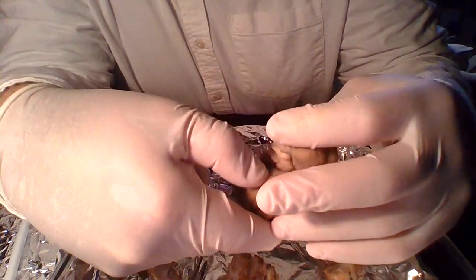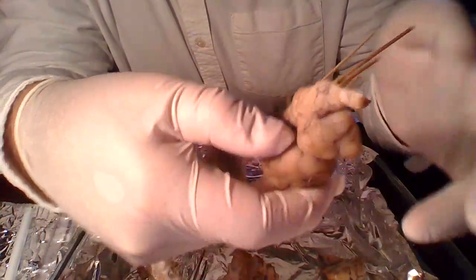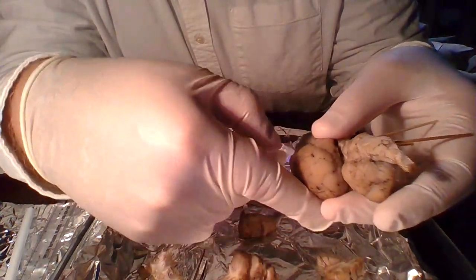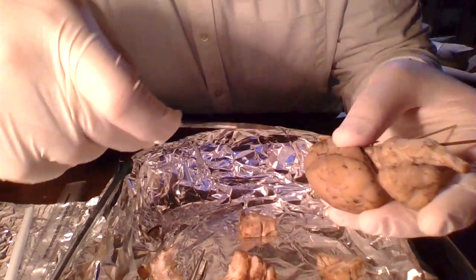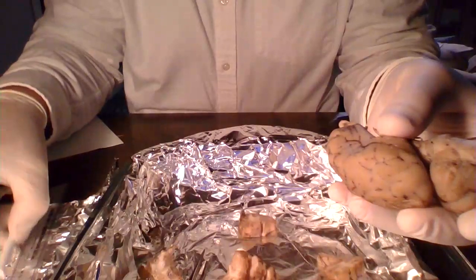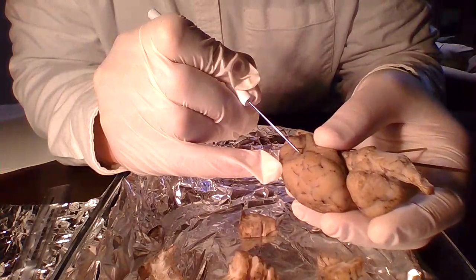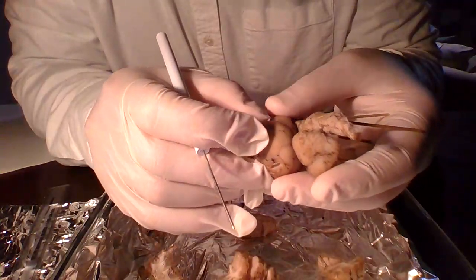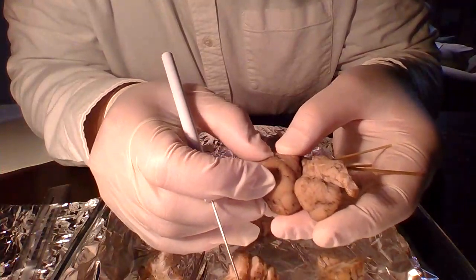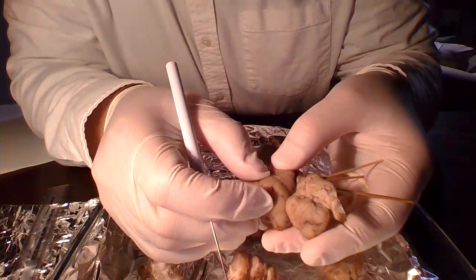And then here's that little cut I made earlier. Let's see if I can open up this other large black spot right there just by pulling at it. Maybe scratch it with the back of this. No. I'm gonna use my prod. I don't want to make a cut exactly, I just want to tease it. No luck. Oh! There we go. There's another sulci opening pretty well.